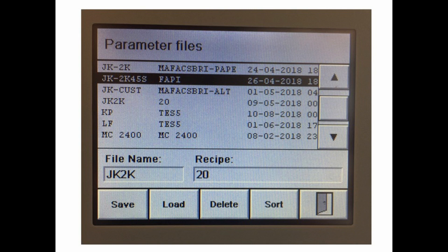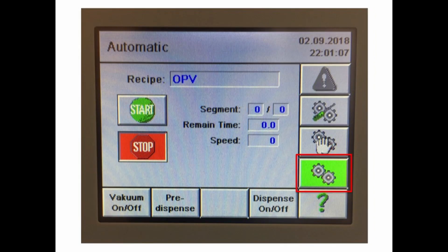After defining and saving the recipe we press the door icon until we return to the main screen and then switch to automatic mode to run the recipe. From here the spin coater can be controlled from inside the glovebox.